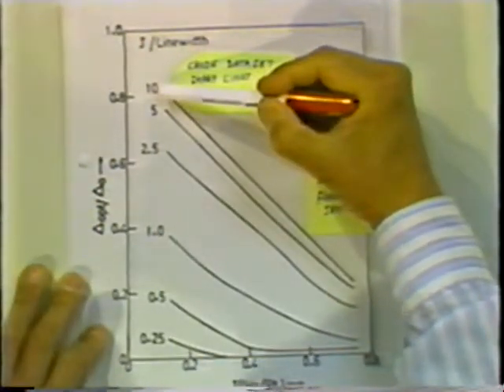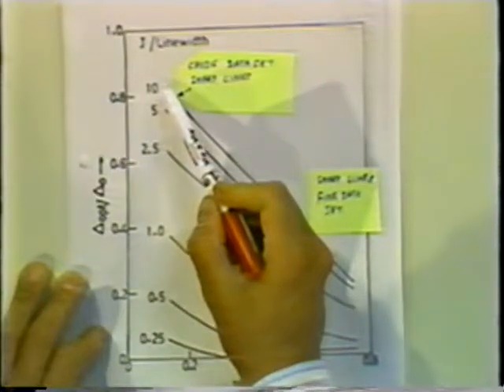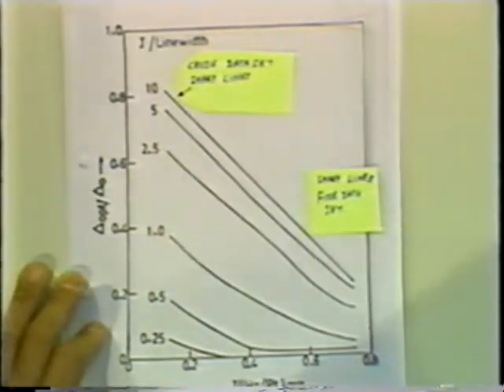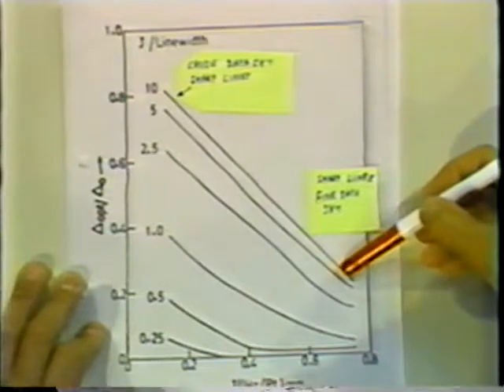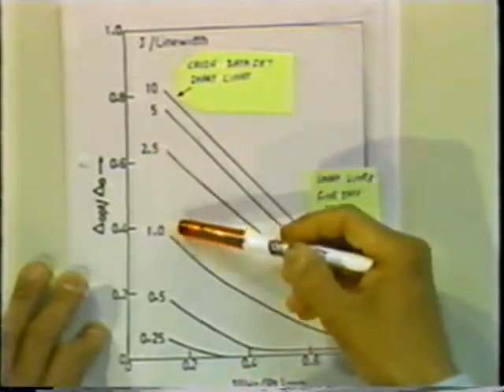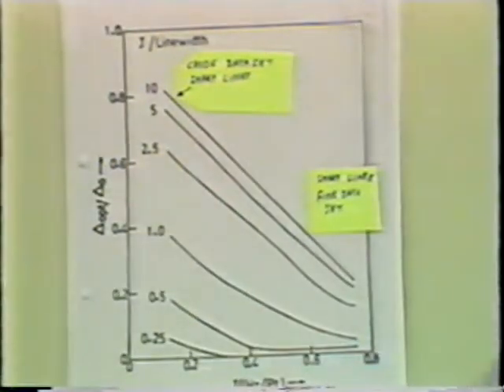Okay, and if you have taken very crude data set, then you need very large delay, almost as much as dictated by the coupling constant. But as you increase your resolution in the T1 dimension, you need less and less delay. Or as your line width is increasing, you need less and less delay. This gives you the maximum signal for a given delay. How much is the maximum signal for a delay?